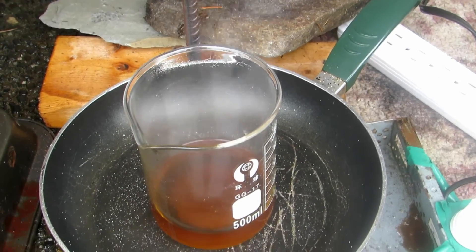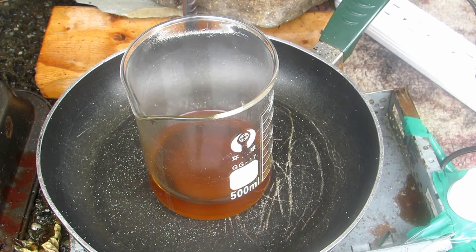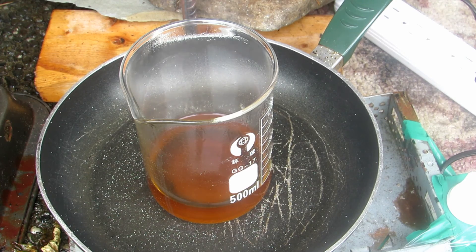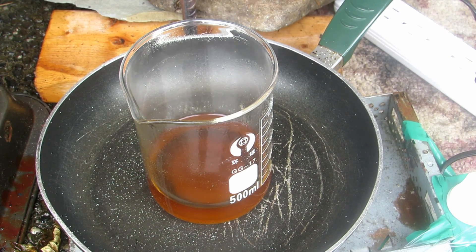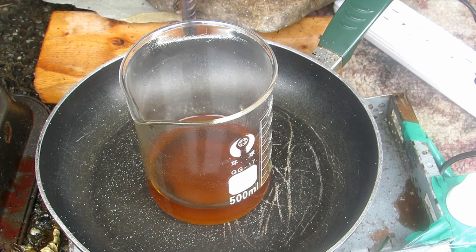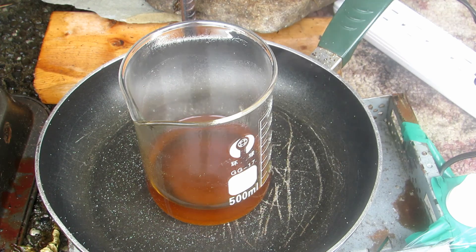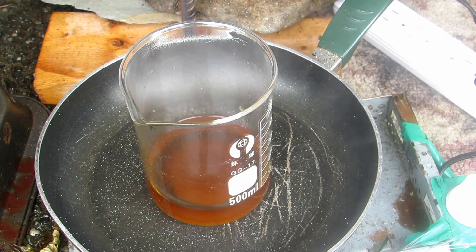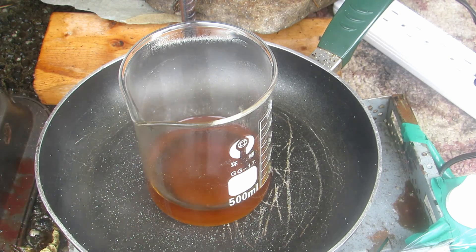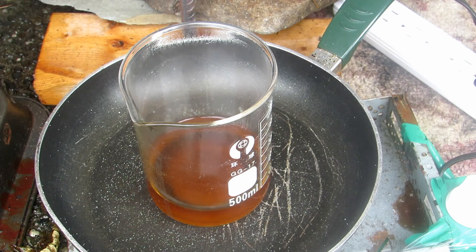So as you can see, upon heating up the manganese chloride, it has fully reacted. All the manganese dioxide has reacted with the hydrochloric acid and it's formed this sort of orangish mixture. I have tried this in the past with pure manganese dioxide and the same result happened. There are some insoluble impurities at the bottom, so we will need to first take this and filter it off.